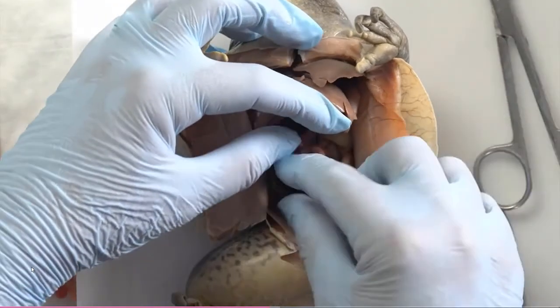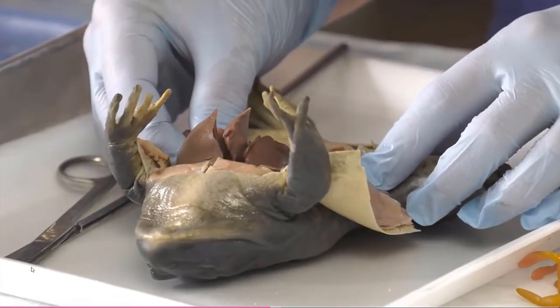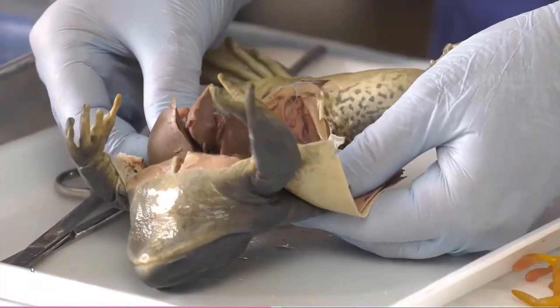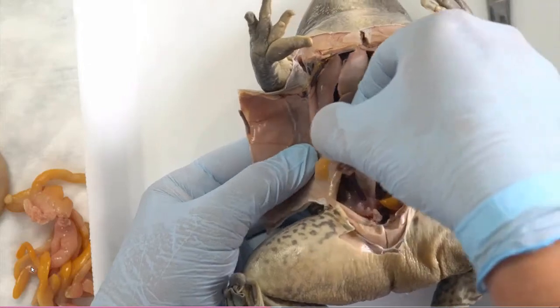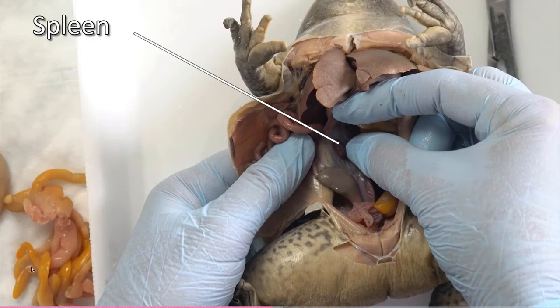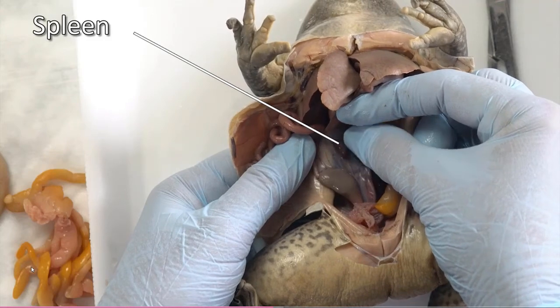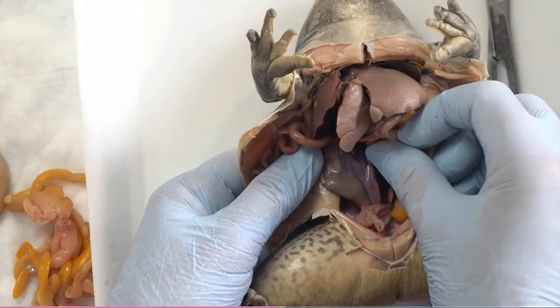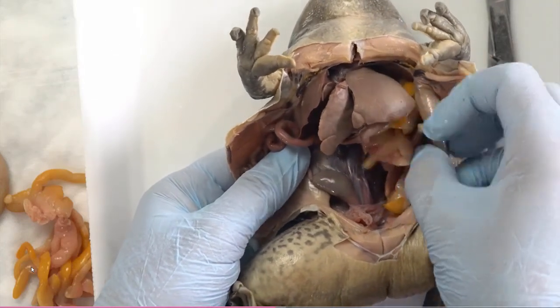I'm going to remove a few of these fat bodies so we can have a closer look later. When looking for the testes in the male frog, it is easy to confuse the spleen and a single testis. The spleen is found in the mesentery between the small intestine and the body wall and is much darker than the testis. The testis sits closer to the dorsal body wall, usually has more of a pinkish coloration, and is located right at the junction of the fat bodies. Also remember to look for symmetry. The testes appear in pairs, but there is only one spleen.